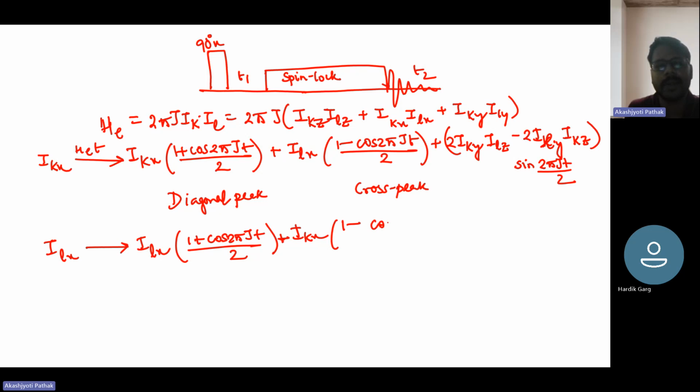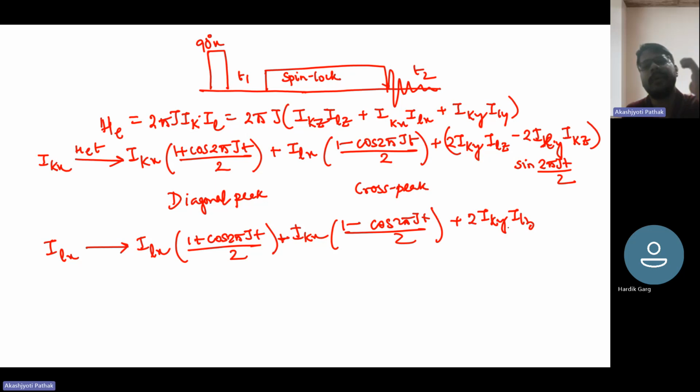This will become minus (1 minus cos 2πJT/2) ILY IKZ plus this will be minus.